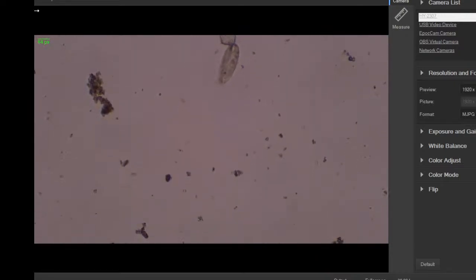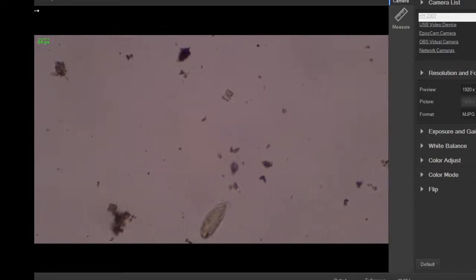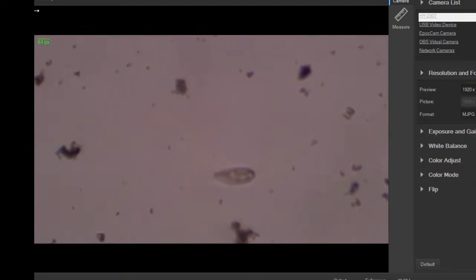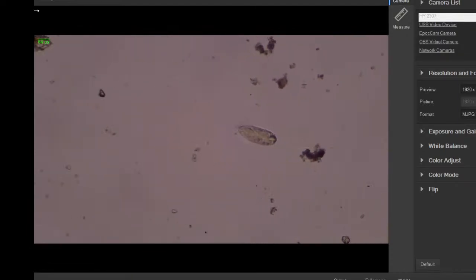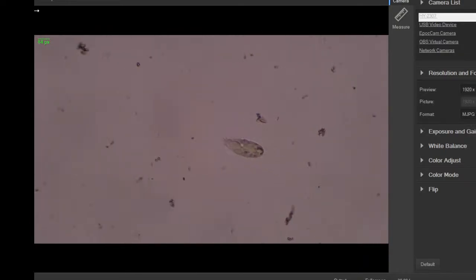They have these shaped kind of like a paramecium. You can see the gullet on it. They have this oral groove thing that acts kind of like a mouth and a throat. But they have these little spiky bits on the top and the bottom. You can see the tapered end is like the top, essentially. That's the direction it swims in.